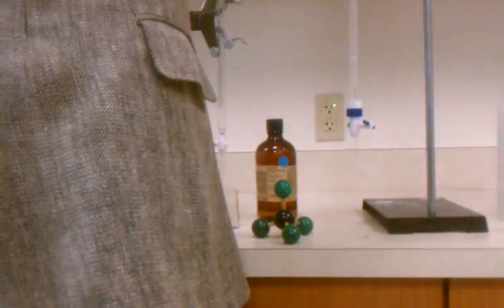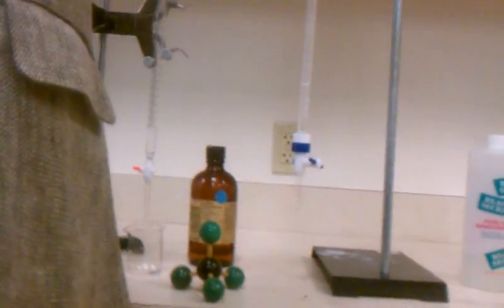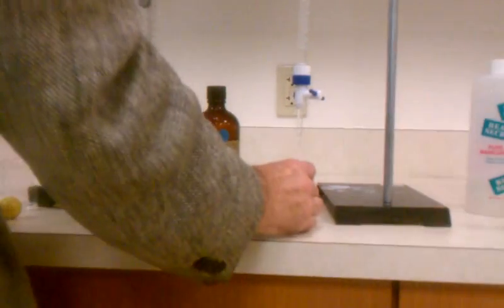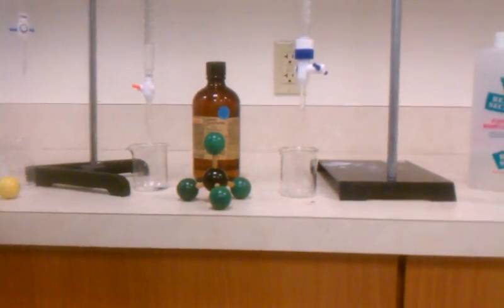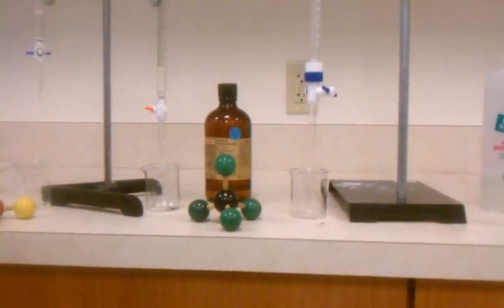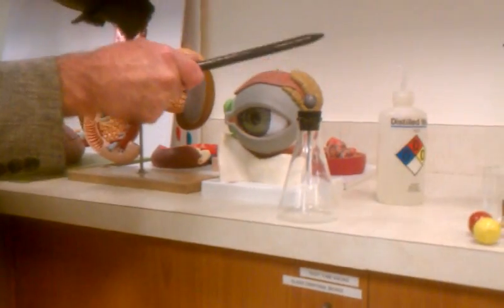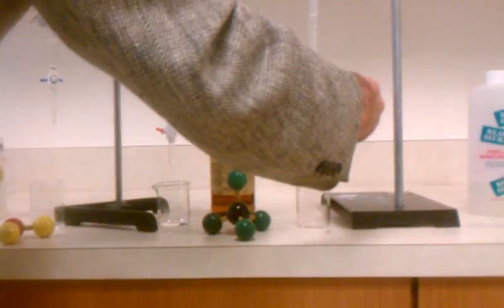And stop it and start over. It's okay, I can pour the chemical back in because there's nothing in the beaker to begin with, so it's still pure acetone. So I'm going to try it again. I'm getting an actual charge, which I can prove with my electroscope. See, there's my charge. So when I open that stream, let's watch.